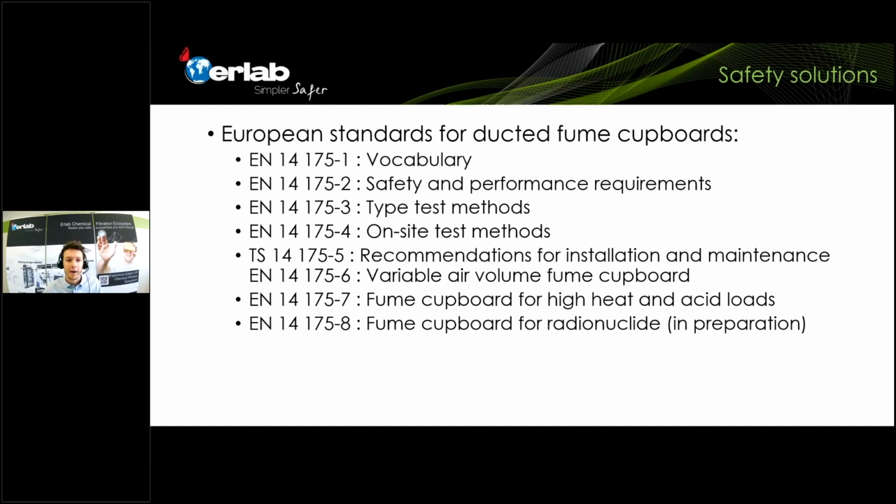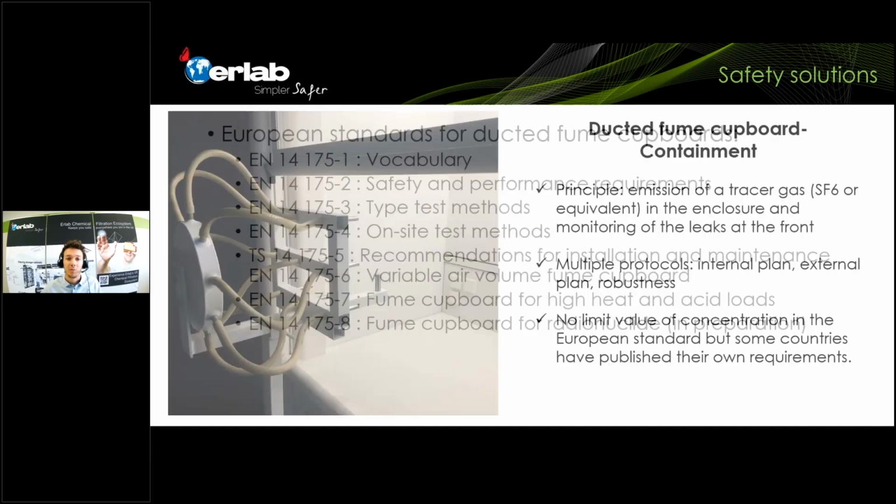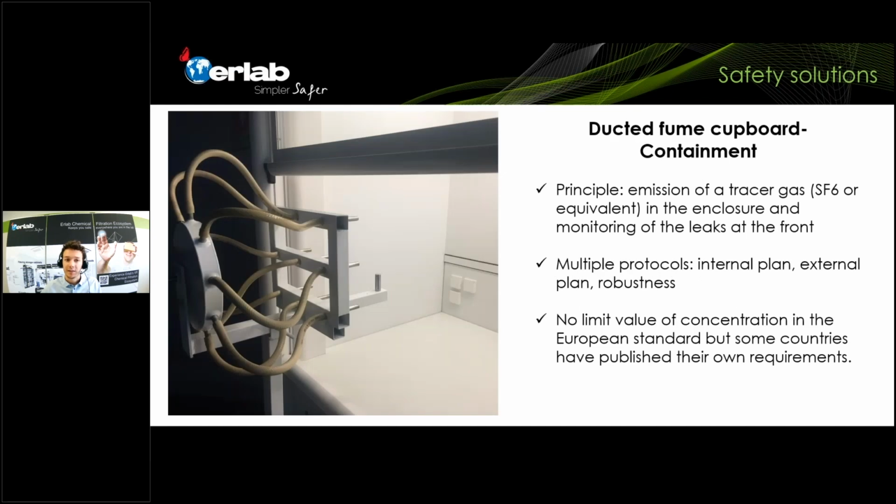Ducted fume hoods, they need to be tested in many ways. The European standard for ducted fume hoods is the EN 14175, and I'm sure that many of you know this standard, but there are many different tests that have to be performed in order to assure the safety, in order to minimize the risk. And so we're going to talk more about part 3 of this standard, which is about containment, a test that we perform about containment.